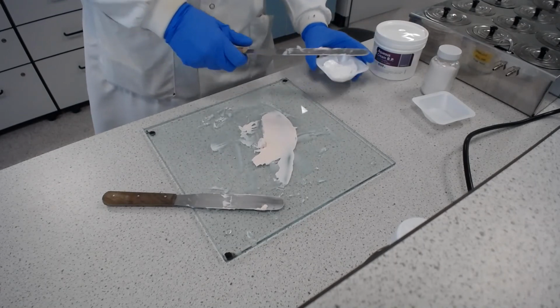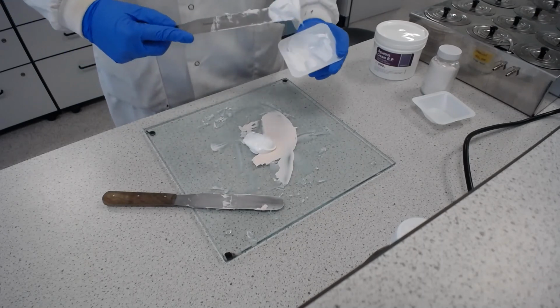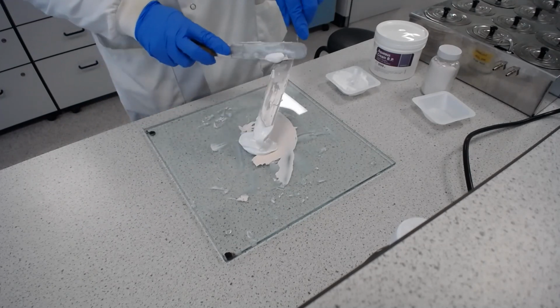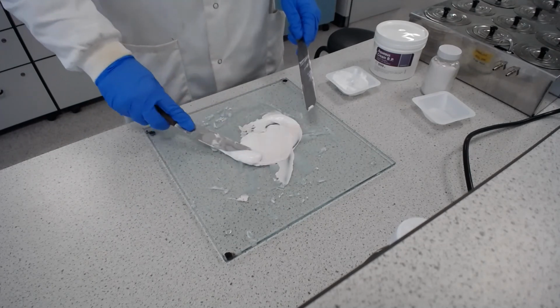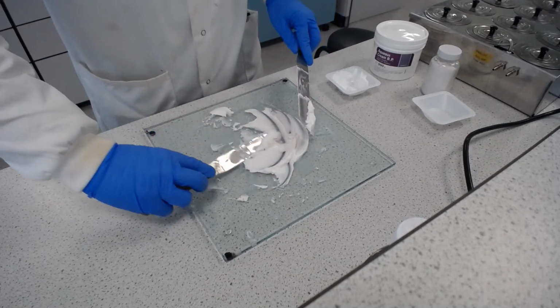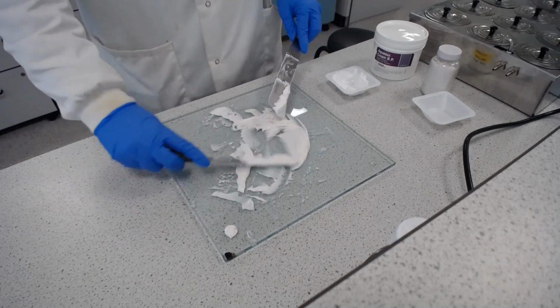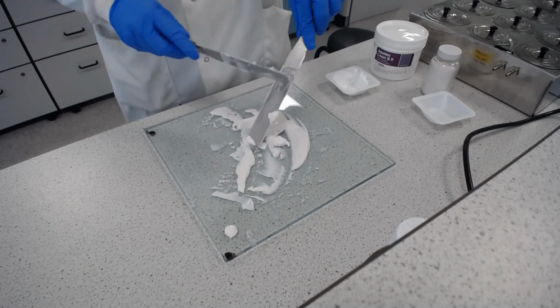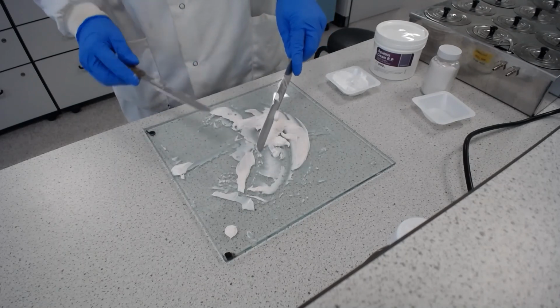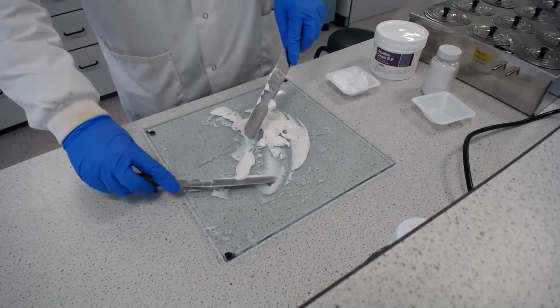And then we need to add in the rest of the base to whatever concentration is required. Now I'm not working off a master formula for this, I'm just showing you the technique. So I'm not going to bother putting any more of the aqueous cream base that I'm using. And as it stops being a paste, it starts flying around a lot more, so we need to be more careful about not going off the edge of the tile so we don't lose our product.